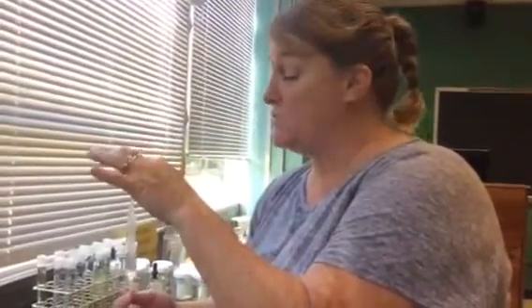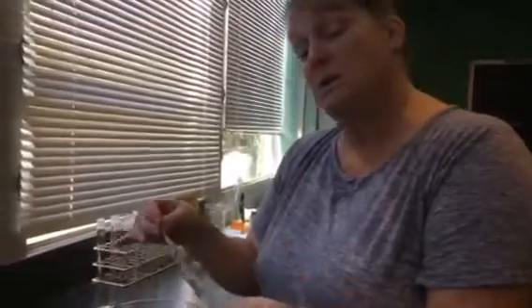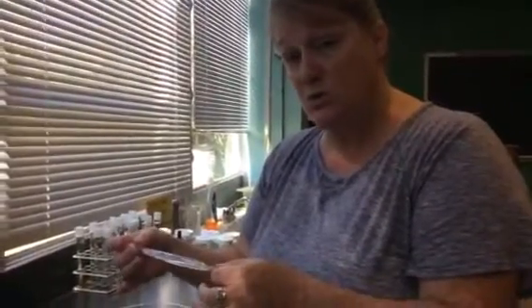You have to make sure that you put the same amount of fluid into each of your mock or model cells, because if you change the amount, it'll change the experiment. And then you're going to take your cell and weigh it before you put it into a beaker of water, and then after that, you're going to put it into the beaker of water for 25 minutes, and then come back and weigh it again. And there should be a difference because osmosis should occur.